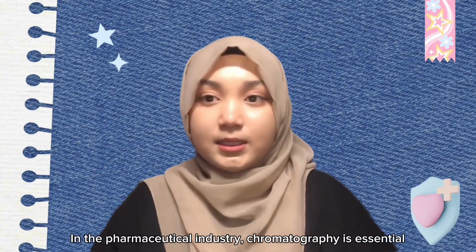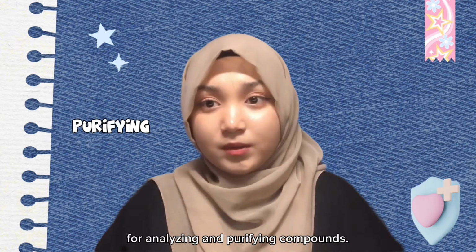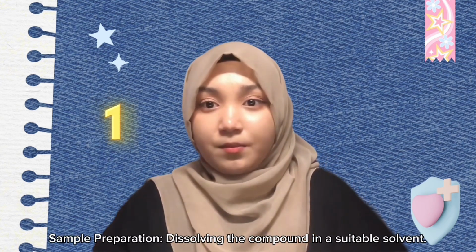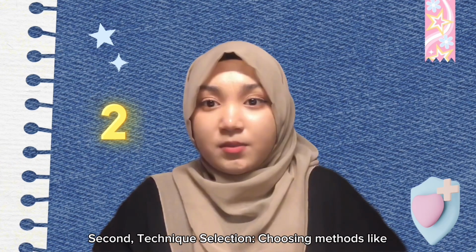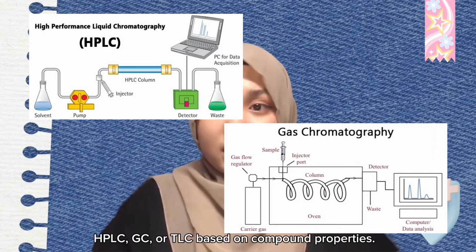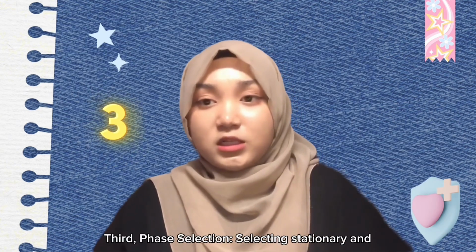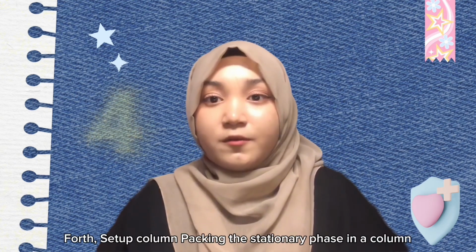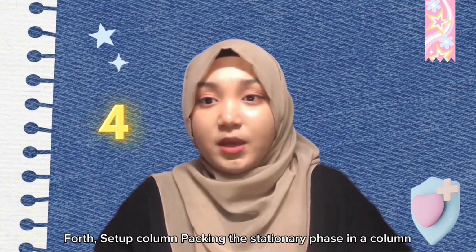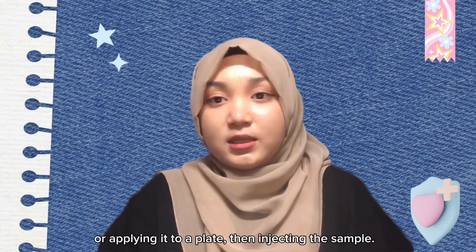In the pharmaceutical industry, chromatography is essential for analyzing and purifying compounds. The process involves, first, sample preparation, dissolving the compound in a suitable solvent. Second, technique selection, choosing methods like HPLC, GC, or TLC based on compound properties. Third, phase selection, selecting stationary and mobile phases for optimal separation. Fourth, setup column, packing the stationary phase in a column or applying it to a plate, then injecting the sample.